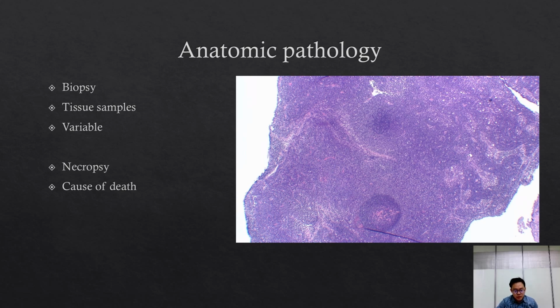Biopsy refers to a piece of tissue taken from a living animal. So tumor biopsy is very common, but we have also done lots of biopsy for other reasons, such as autoimmune skin disease, inflammatory skin disease, or inflammatory bowel disease. There are many different things, not just tumors. This shows you an example of a lymphoma in the lymph node, which is a common pathology finding we observe. And then we also do necropsies.